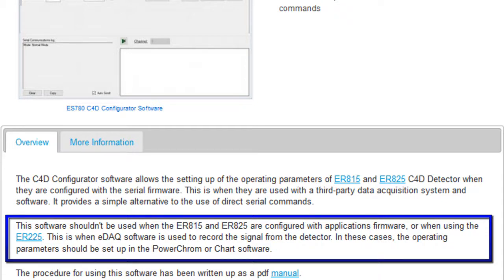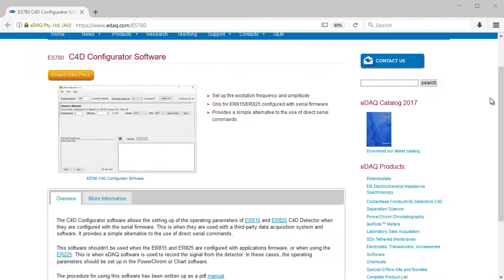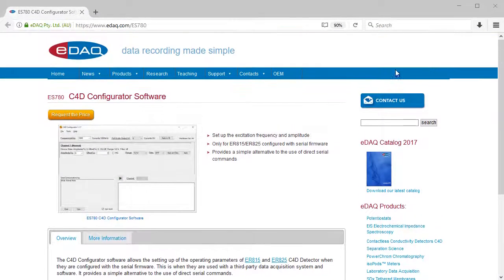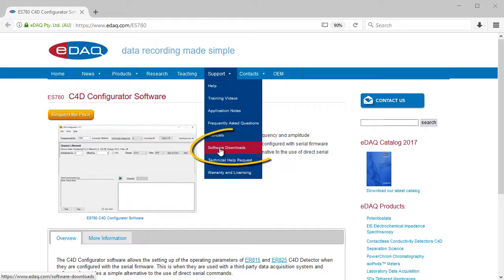For this, you should set up the parameters in PowerChrome or Chart software. You can download the software from the EDAC website, support, software downloads.